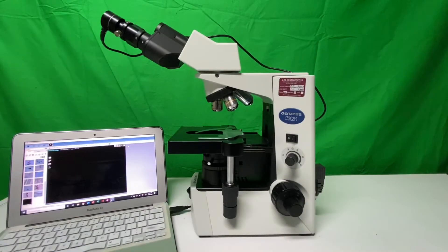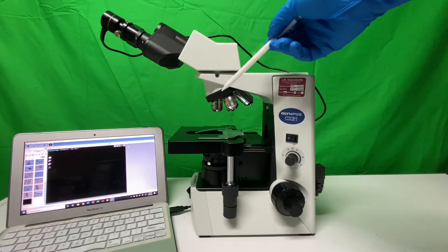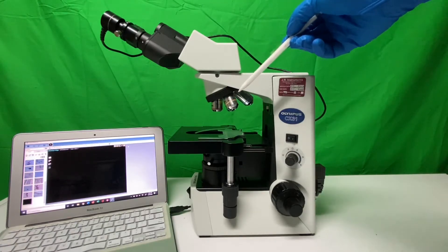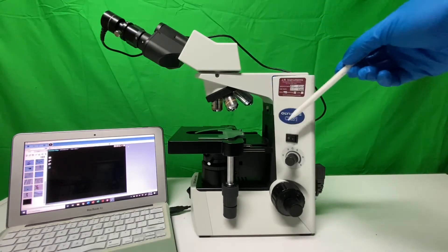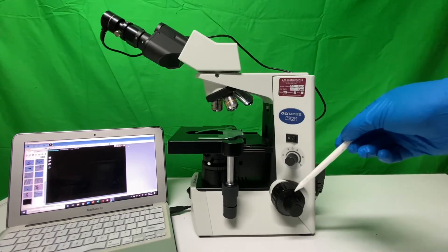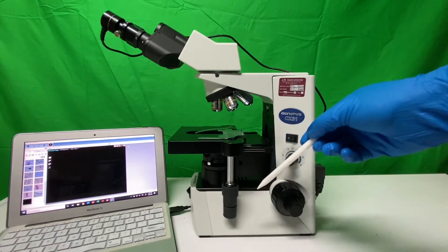Let's break this down from the top: our oculars that magnify ten times, our revolving nose piece with a rubberized handle which allows us to shift objectives, our four objectives, our stage with a stage clip or specimen clip, our light switch, our light dimmer, our coarse knob, our fine knob, and the Y and X shifters or clip stage maneuvers so we can move around our actual stage.